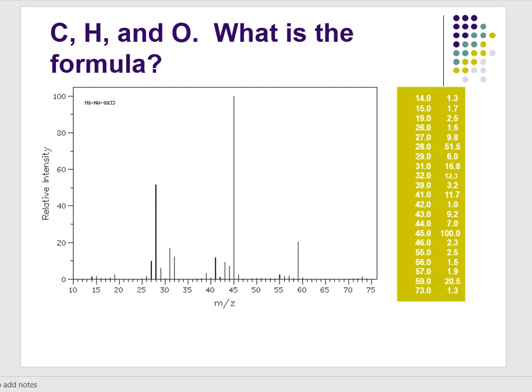I look at this mass spectrum and I try to find the M peak. Well, I see a big one right here, but look, there's going to be one way out here at 73. It's kind of tiny, but this is the last one that they give me on this chart of data.